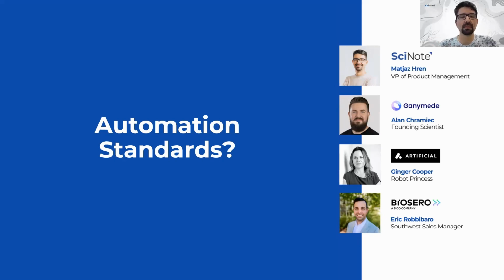I think everyone who's been working in the lab feels this, and knows that there is no easy way to connect the instruments or data flows. But there have been quite a few different attempts to standardize the data flows, and I'll talk a little bit also about standardizing the automation.